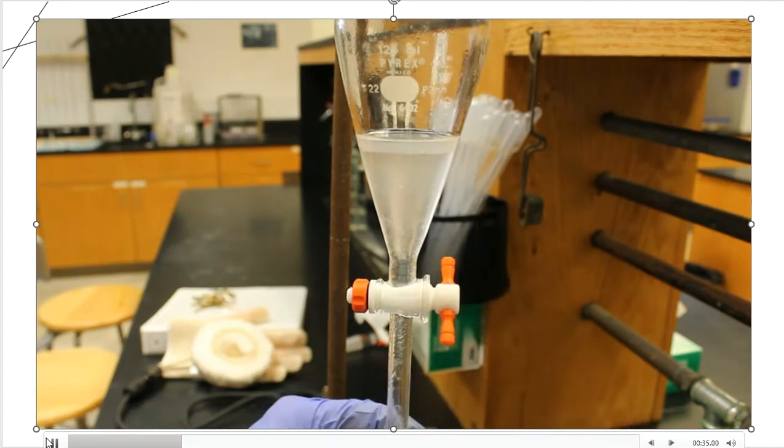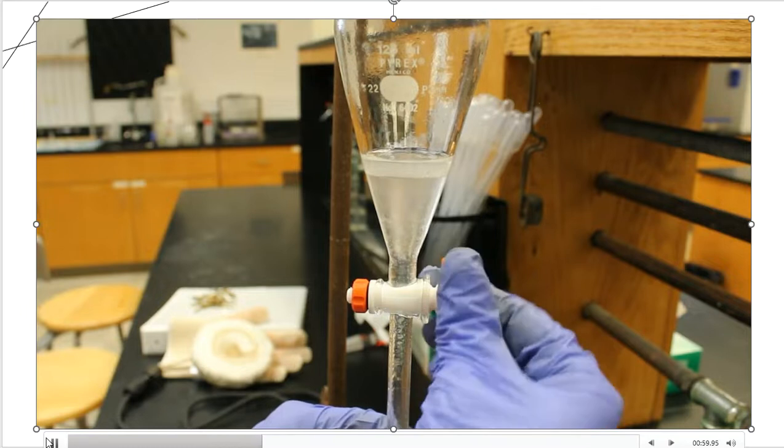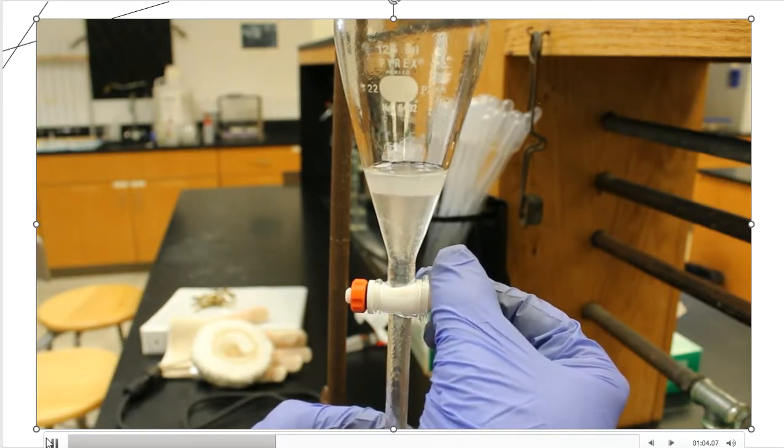So I'm going to slowly open the stopcock. I'm going to drain the methylene chloride out, and that's what you're seeing in the video now. And then here up at the top, that is the sodium hydroxide that I do not want. So before that goes through the stopcock, I'm going to stop at that moment, and then I'll drain that into a discard beaker. I don't want that. I don't need it. It's going to eventually go down the drain. So we'll just make sure that that happens.